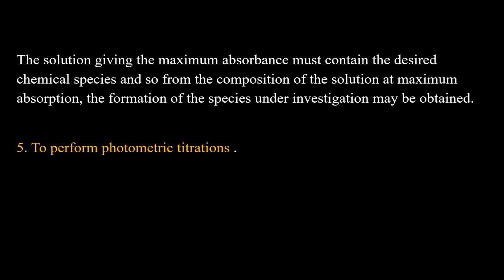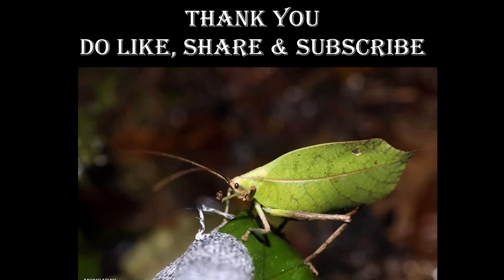Fifth one, to perform photometric titration, that is the last function of spectrophotometry. With this, I have finished the instrument spectrophotometry.